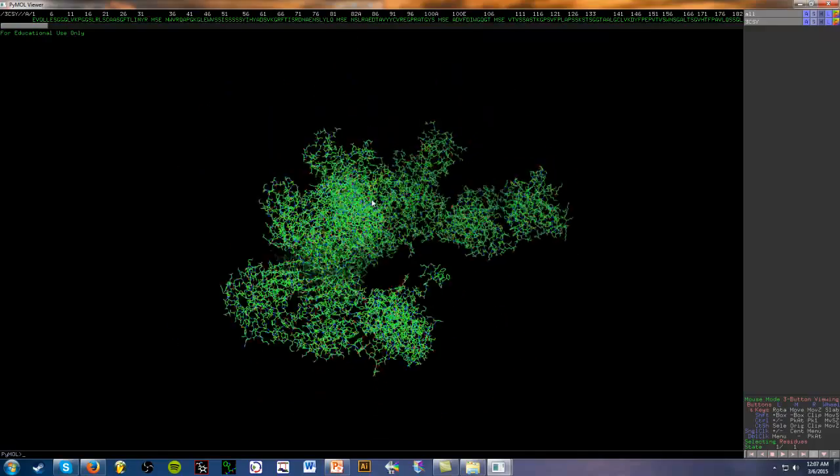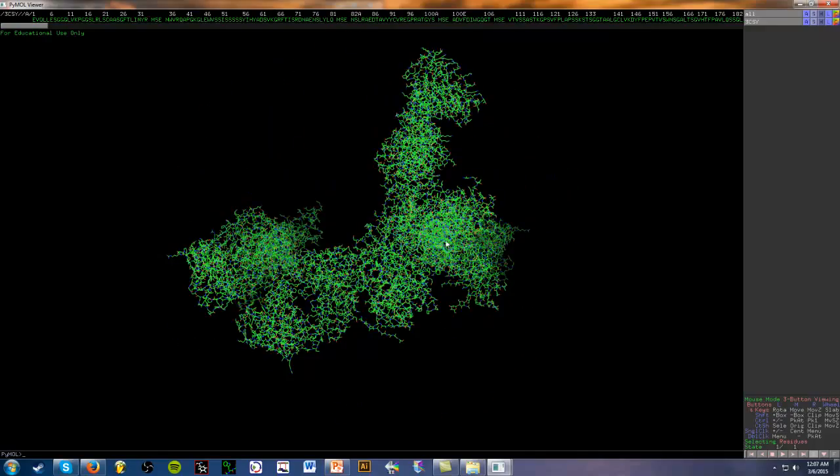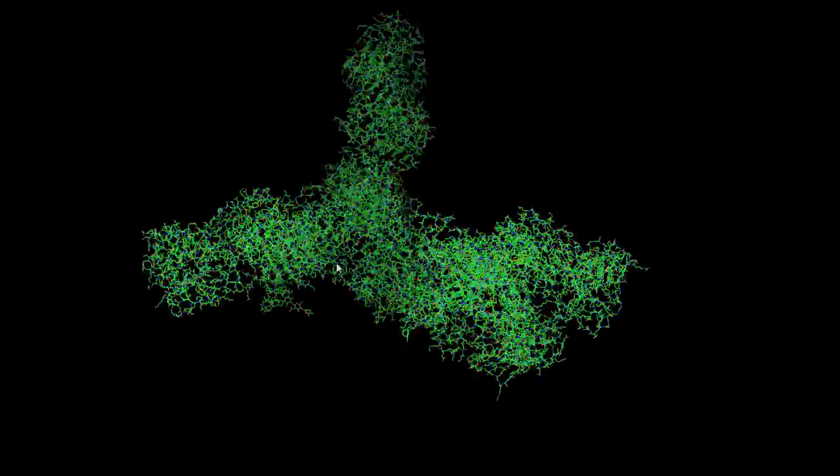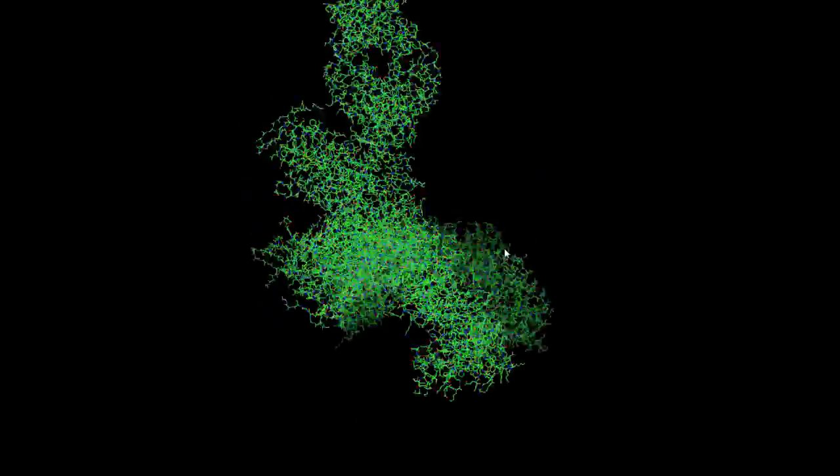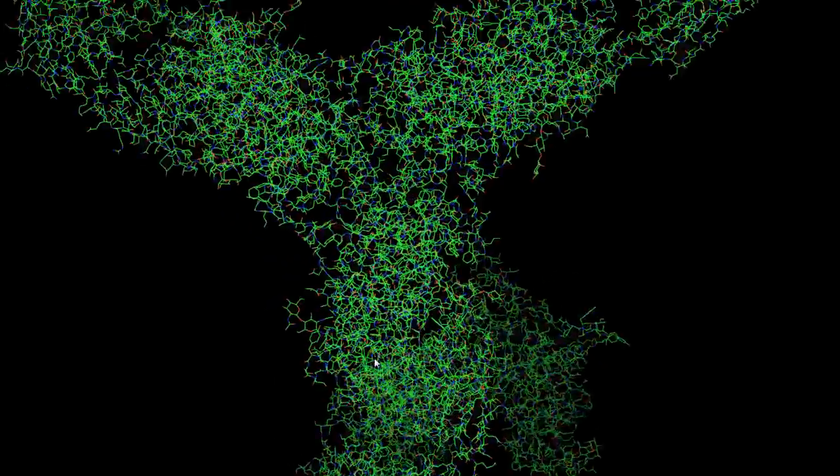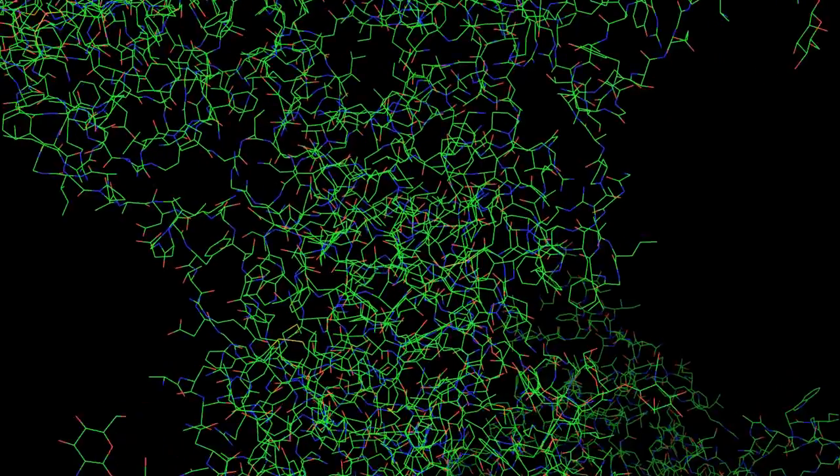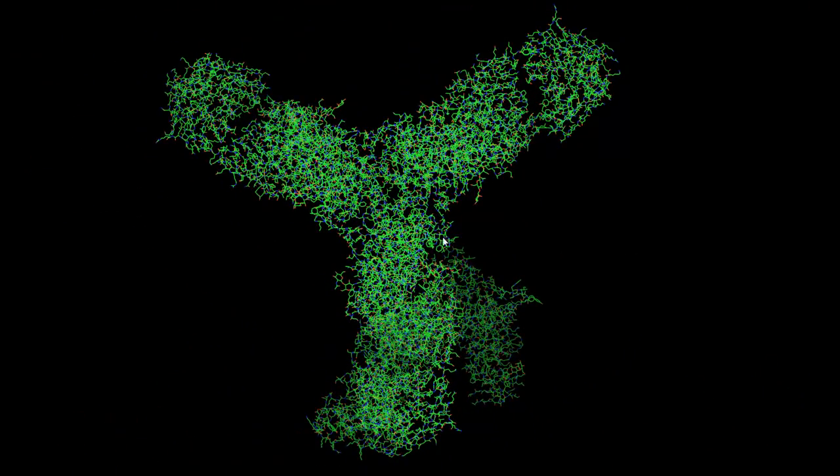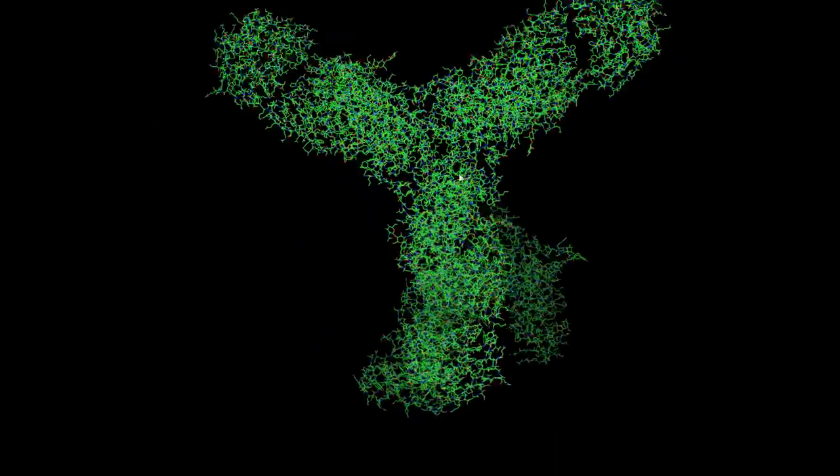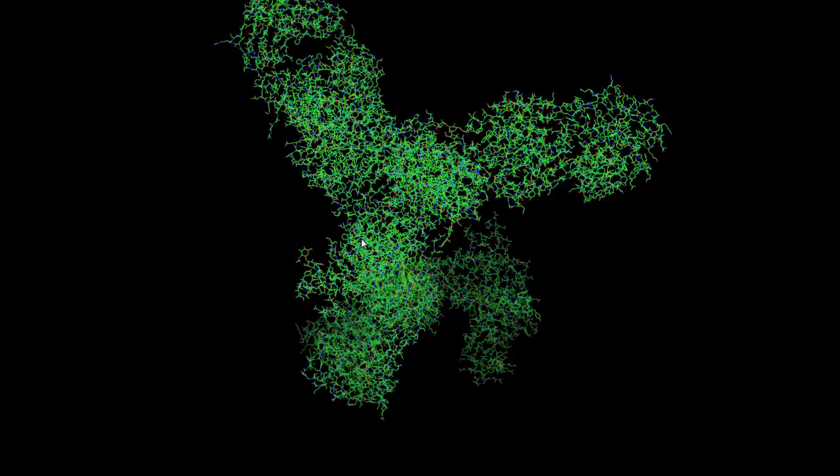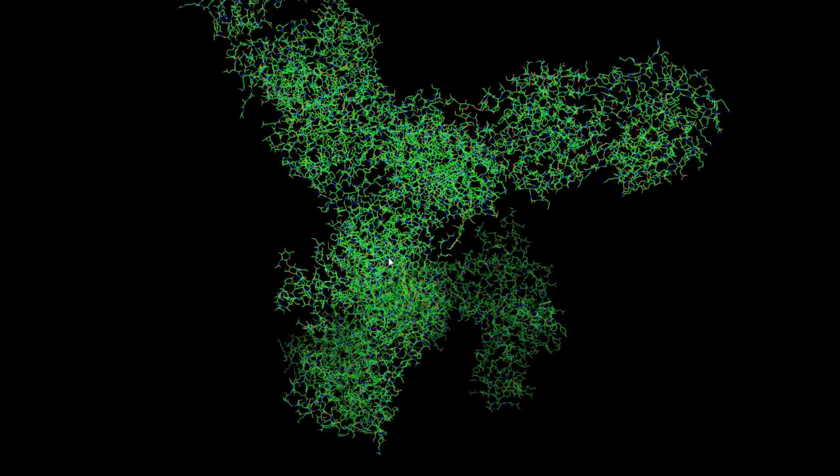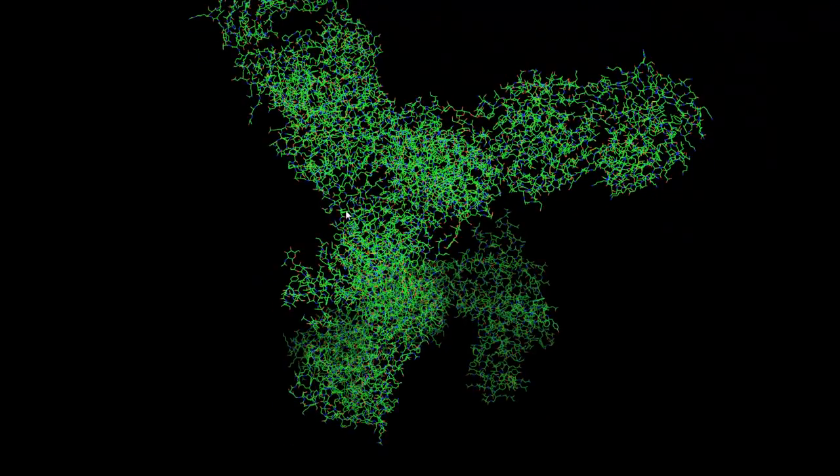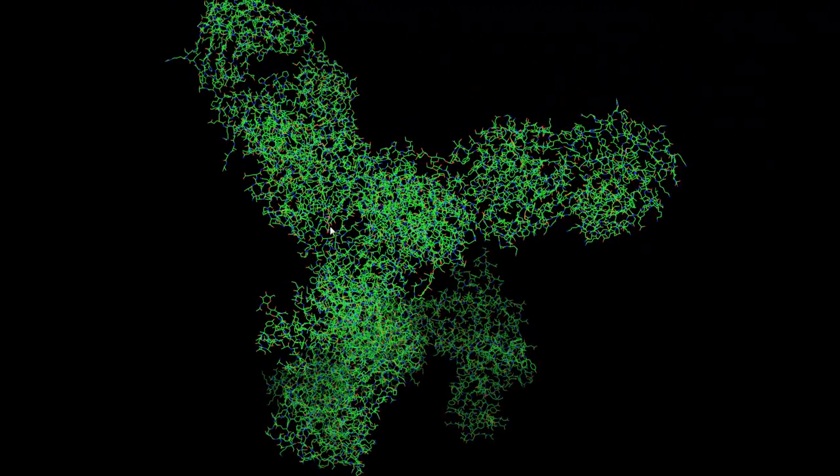We can move around the protein structure by using our left mouse button to rotate it. The right mouse button lets us zoom in and zoom out. And we can basically move or transform the protein structure by holding down the middle mouse button. So left mouse button rotate, right mouse button zoom in, and the middle mouse just to move it around.